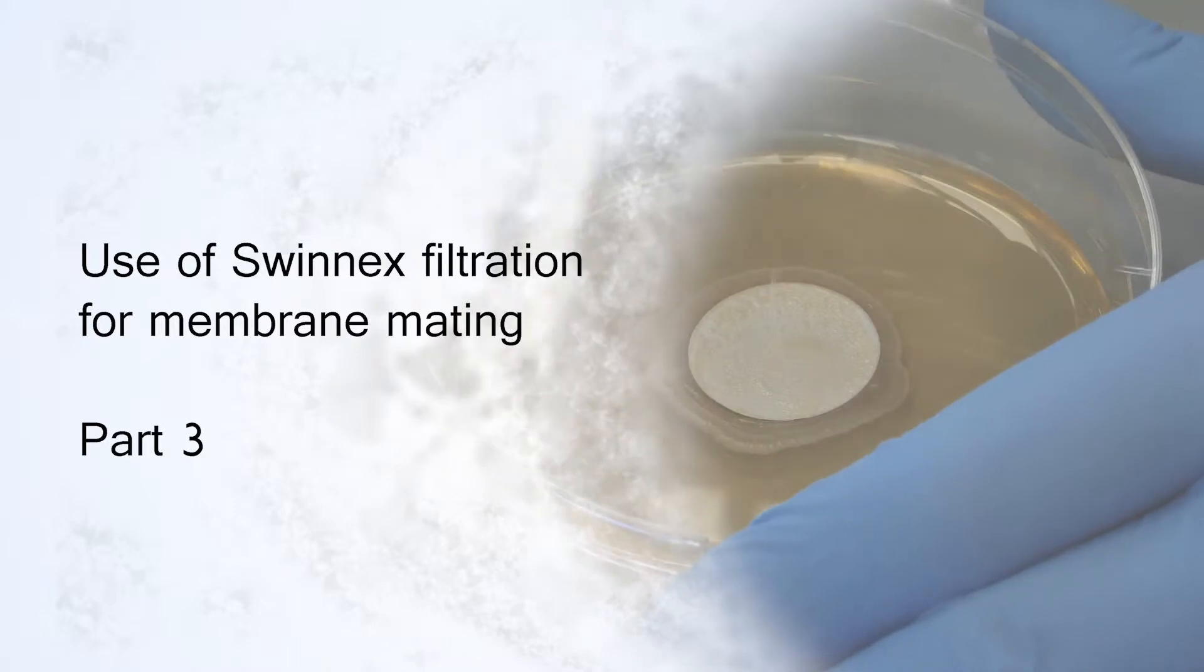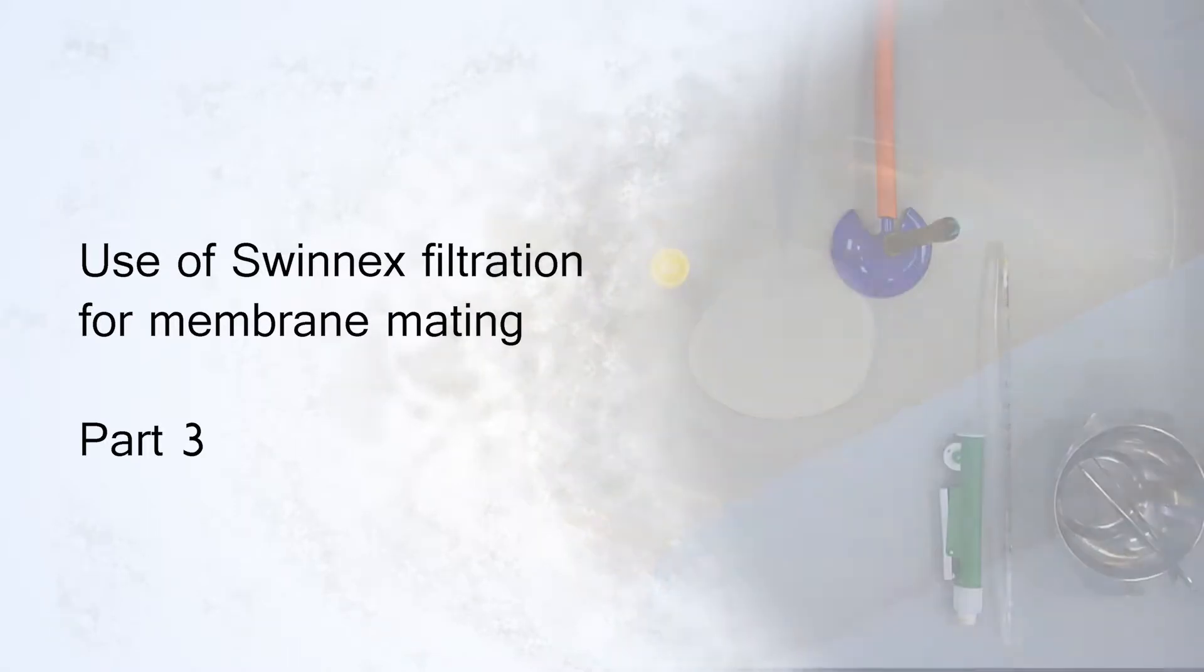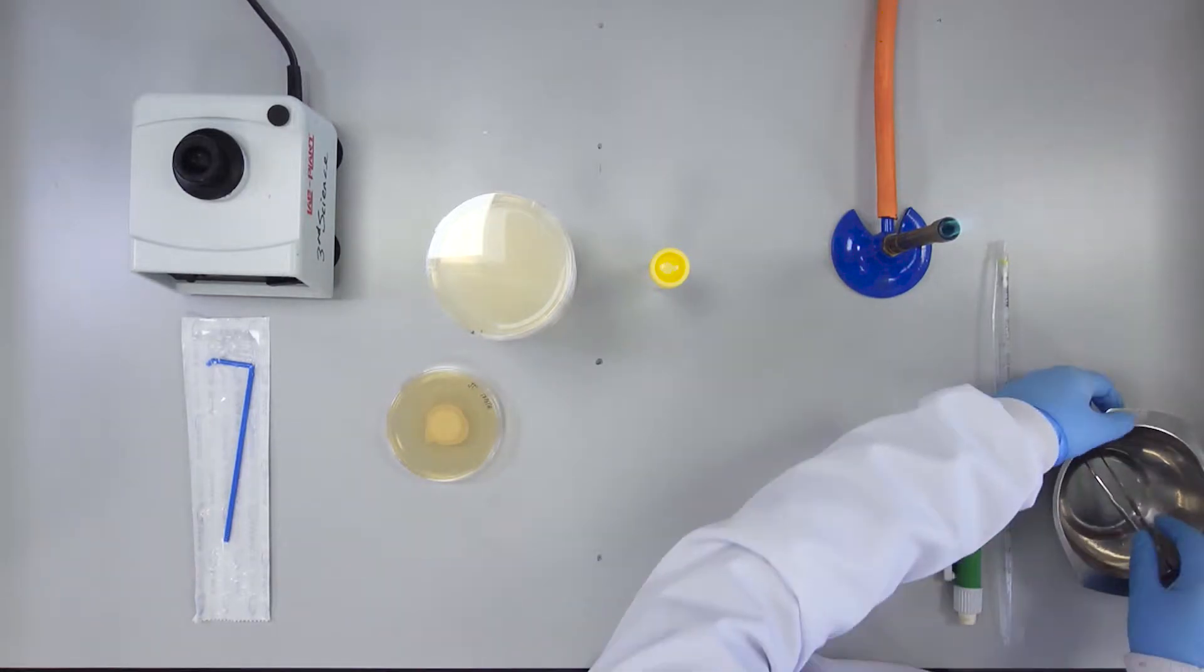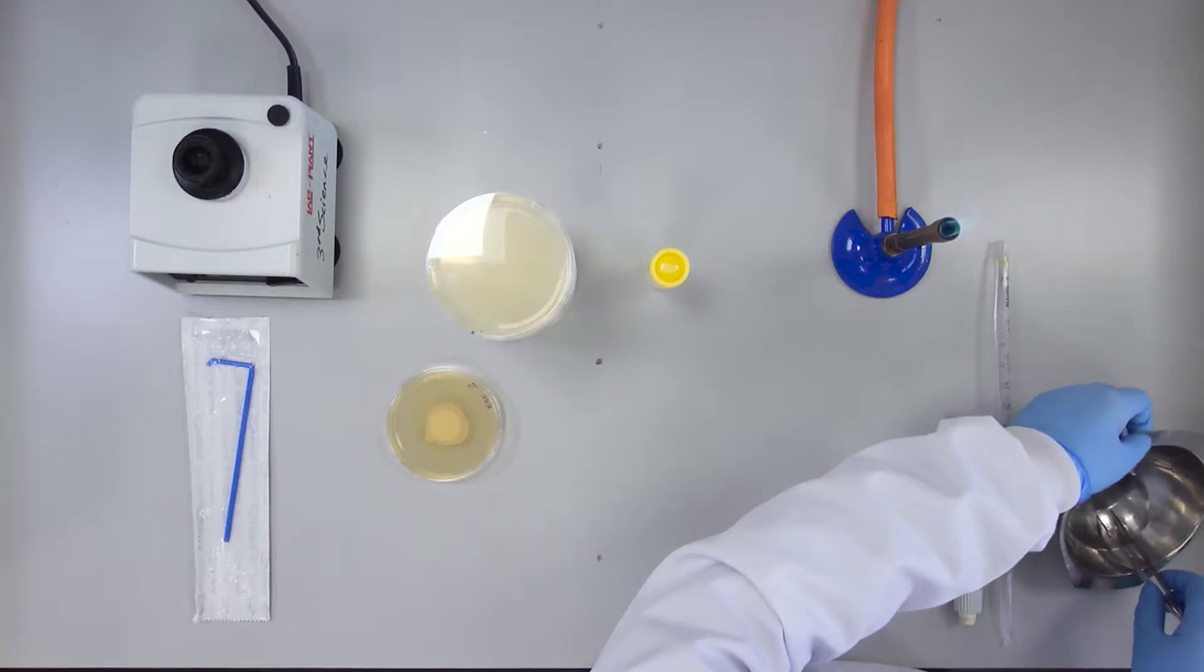Use of Swinex filtration for membrane mating, Part 3: Isolation of transconjugants. After incubation of the mating membrane on TSA, the next step is to isolate transconjugants.